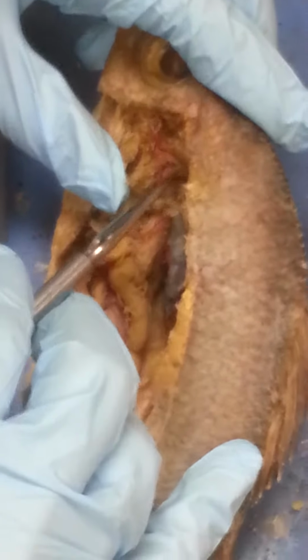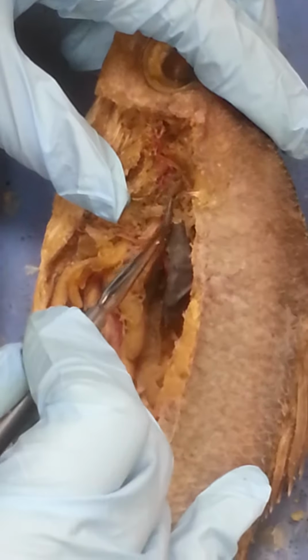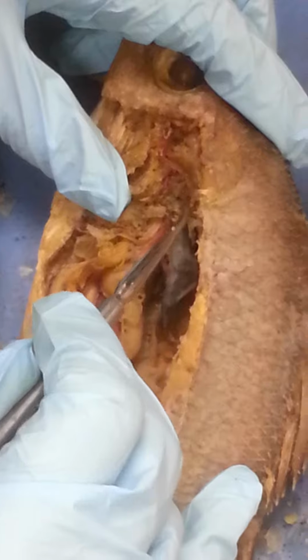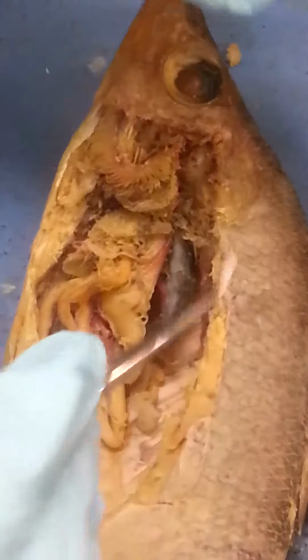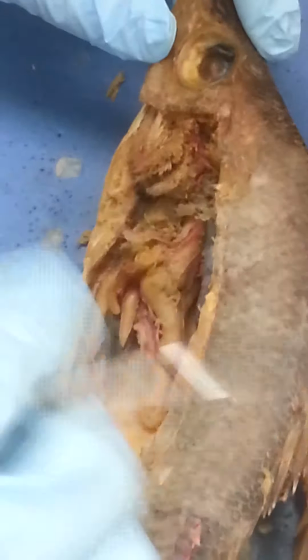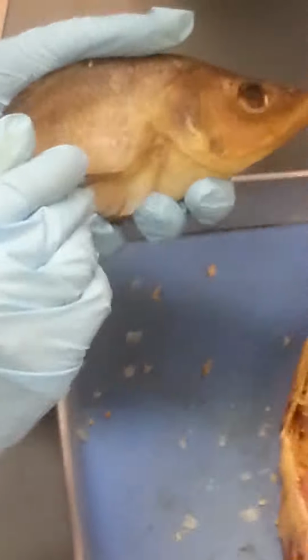It breaks here into your subclavian, this little stub right here. And the reason it's just kind of a stub now is because it goes to the pectoral fin. And since you've taken off the whole side of its body where the pectoral fin is, it's just broken, so it literally comes out right here to right there.